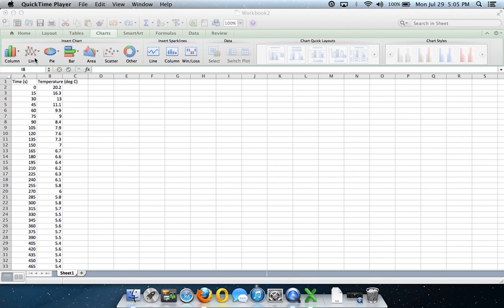Okay, I downloaded your spreadsheet and loaded it into Excel. I'm looking right now at the data from your run number 9. I'm assuming that this is one of the solute added to the solvent, so these are one of the solution runs. Currently there is no graph, and what I'm going to do first is just do a simple graph looking at your raw data, so that way we can go ahead and do the trend lines.